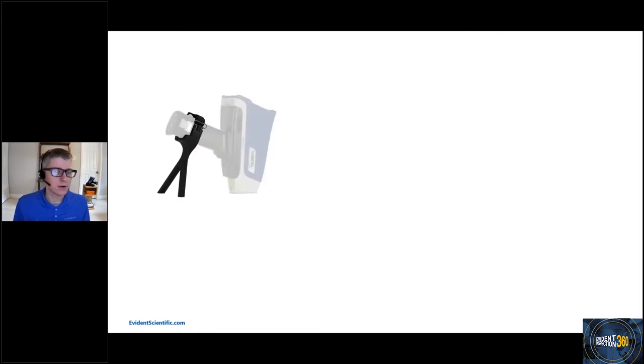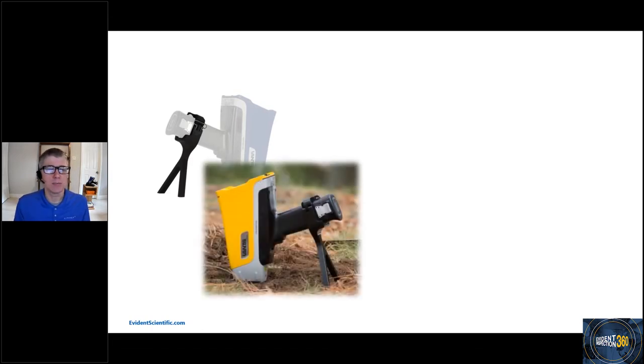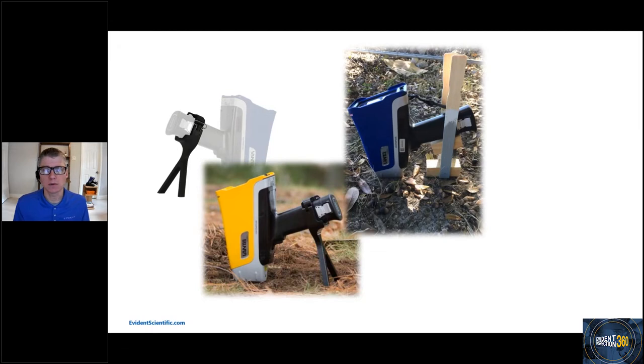And so we have our XRF instrument. We also sell an accessory called the soil foot. Turns the instrument into a tripod type setup, so you don't have to bend over while the test is running, doing soil analysis or that sort of thing. But when the Vanta was first released, we didn't have the soil foot accessory. I had to do some testing for a client, and so you can see here my paint sticks and a couple 2x4s. I'm gonna get her done here with my MacGyvered soil foot.